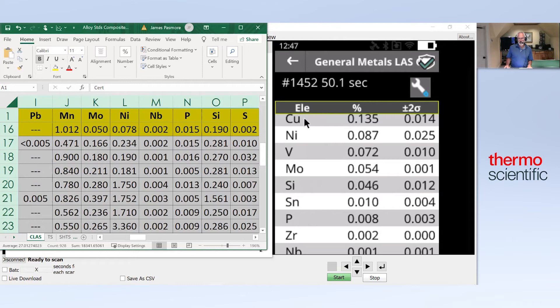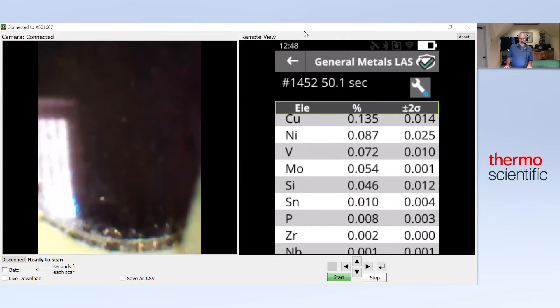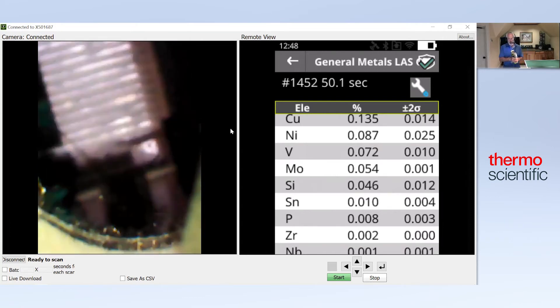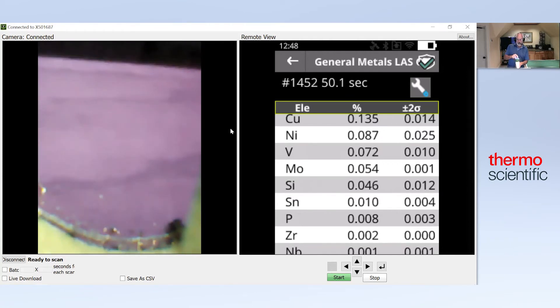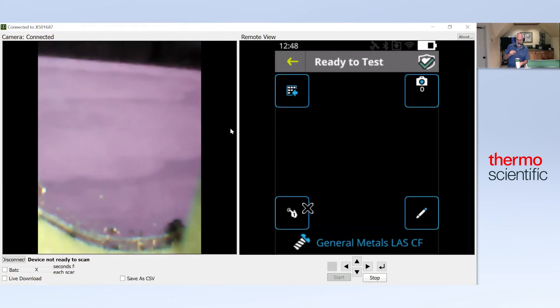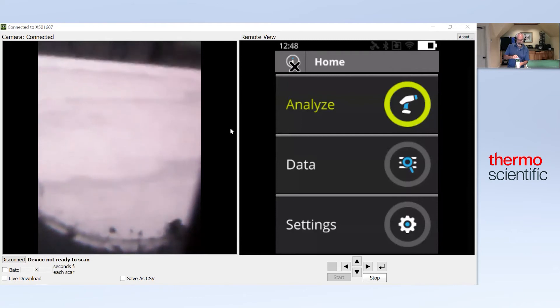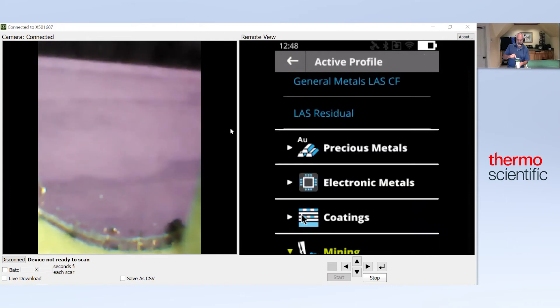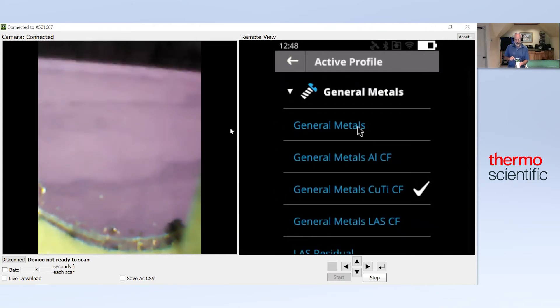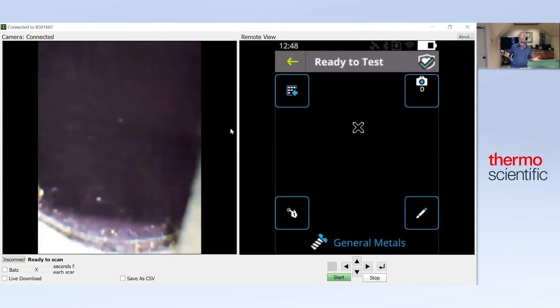We're going to switch now to another application, quick sorting. This is an application you'll see typically in the scrapyards. Some of the most important alloys in scrapyards are stainless steels, aluminum alloys, and then you get into the high value like the nickel base and sometimes coppers and titaniums. I'll start with the aluminums because that's an area most people have issues with in terms of the ability to sort quickly. I'm going to switch my model to the general metals. This is the factory calibration, and this is the one you'll be using most of the time for almost everything.